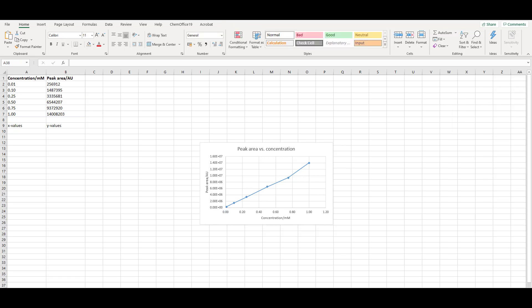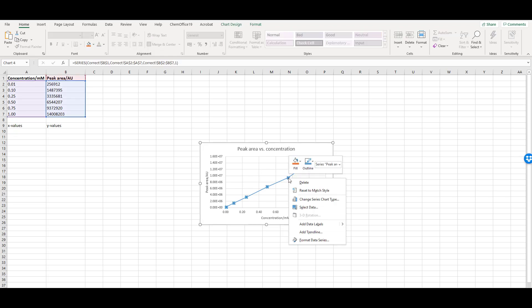Once the graph is formatted, we need to apply a line of best fit and determine the linear regression equation. To do this, right-click on the dataset on the graph and select Add Trendline.